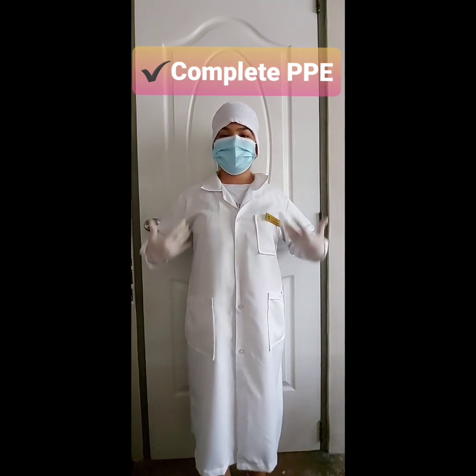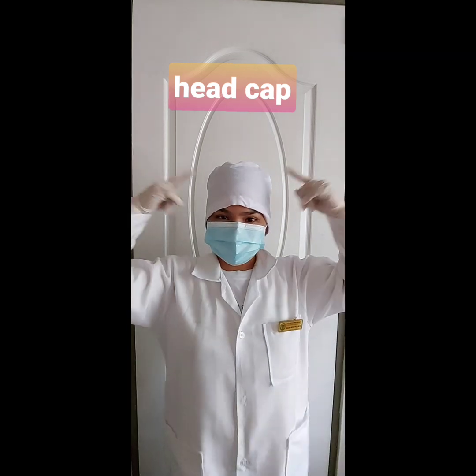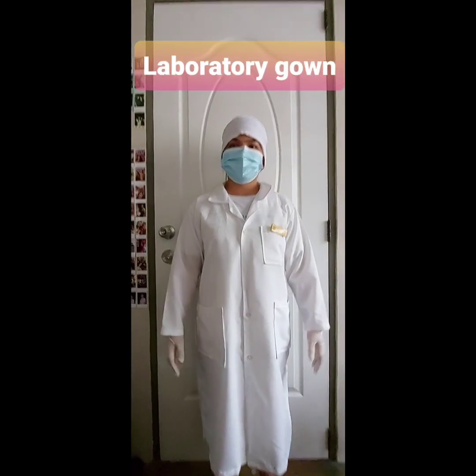Complete PPE must be worn before entering the laboratory: disposable head cap, face mask, a pair of gloves, and your laboratory gown.